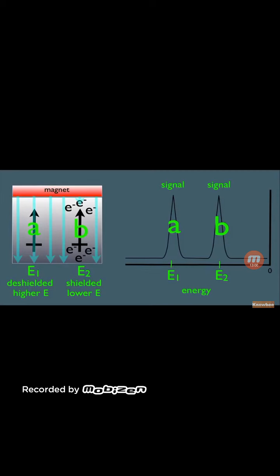Well, let's look at an actual organic molecule here. Here we have chloroethane. Let's take a look at the type of environment each of the hydrogens in chloroethane would be in. For instance, let's focus on these hydrogens right here first. Let's represent them as a magnet with this particular orientation. Remember, this magnet represents the nuclei of the H atom, and that nuclei happens to be surrounded by electrons.